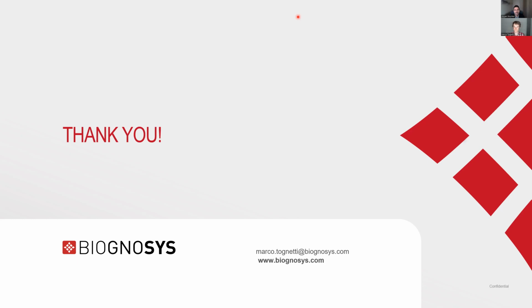Okay. And the second question is, are you processing your DIA data using direct DIA modes? How is the data processing time using unspecific digestion?